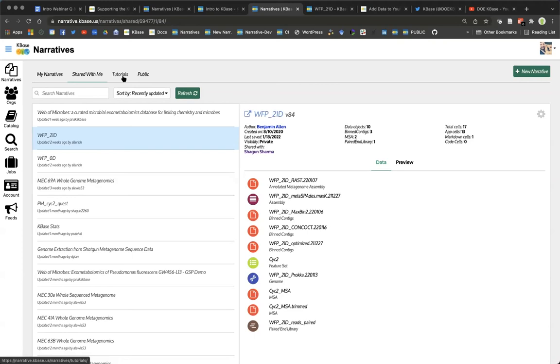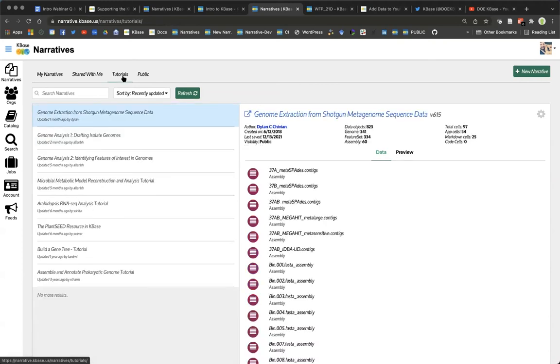I didn't do much showing you all any detailed workflows or anything like that today. We're going to have lots more webinars this year where we do that. And like I said, there's a lot on our YouTube page, where we've shown some different workflows. But when you're in the system, and if you want to look at some tutorials and some examples of using the system, just go to the tutorials section here in the narratives navigator, and this will show you all of the different tutorials we have.